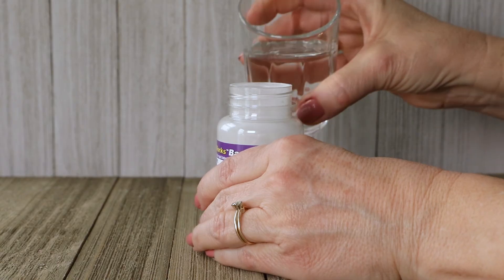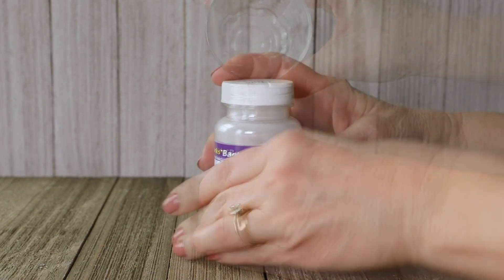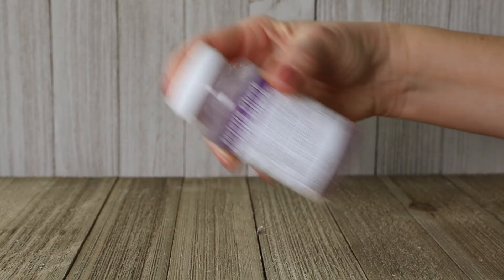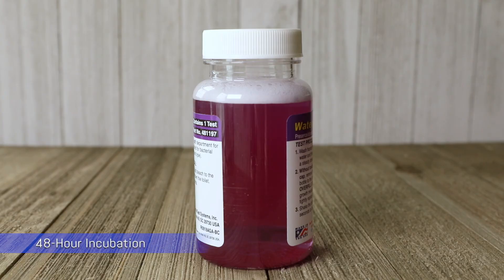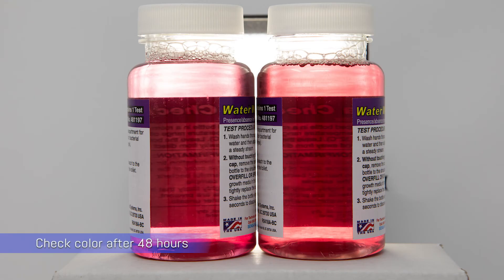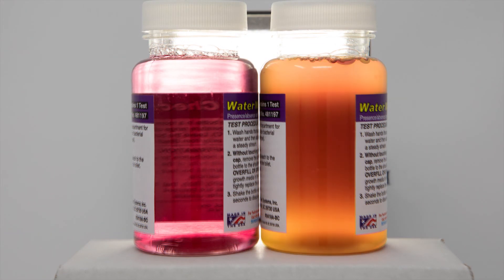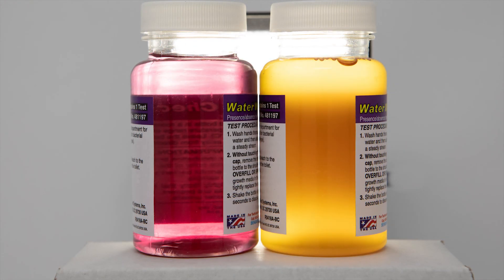Test for bacteria by filling the jar to the shoulder with water. Cap and shake for 20 seconds. Place the jar in a room with a minimum temperature of 70 degrees. If the color remains purple, the test is negative. If the color turns yellow, bacteria is in the water. Discard the jar after 48 hours.